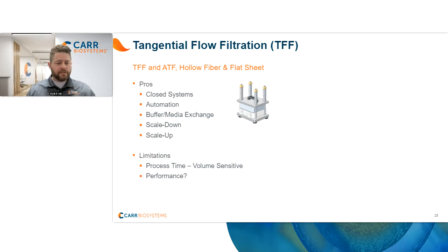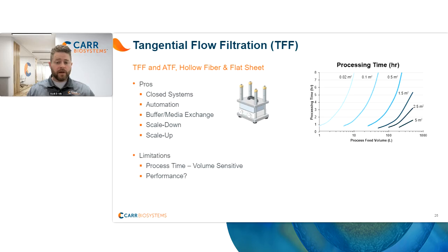And there are some minor limitations here and maybe some considerations. We'll go into more detail on performance. One of the considerations here is processing time. While there's great solutions, this is an example from a vendor today. There are great solutions across the process feed volumes. There isn't, as you scale on a particular device, for example, this 0.02 meter squared device, as you increase the volume, you increase the processing time pretty linearly and pretty dramatically.